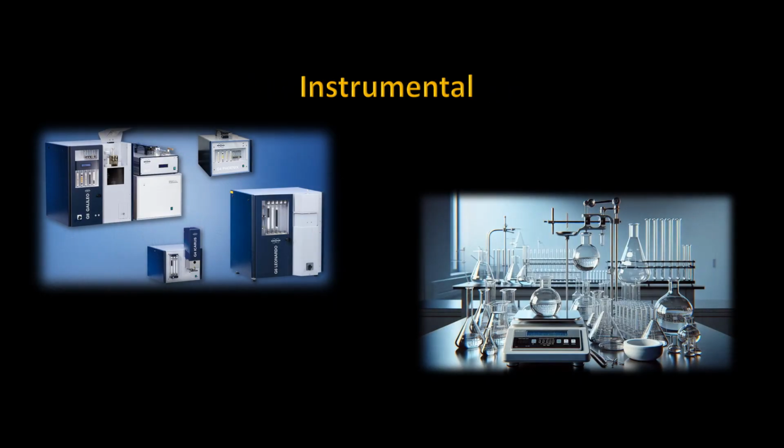Instrumentation may be used for qualification, but mostly used for quantitative analysis. Instrumentation requires the samples are dissolved in a solution. The exceptions are X-ray diffraction, X-ray fluorescence, and maybe neutron activation spectroscopy, where samples can be solids. However, instrumentation is expensive to purchase and expensive to maintain. Classical chemical analysis is much less expensive compared to instrumental.